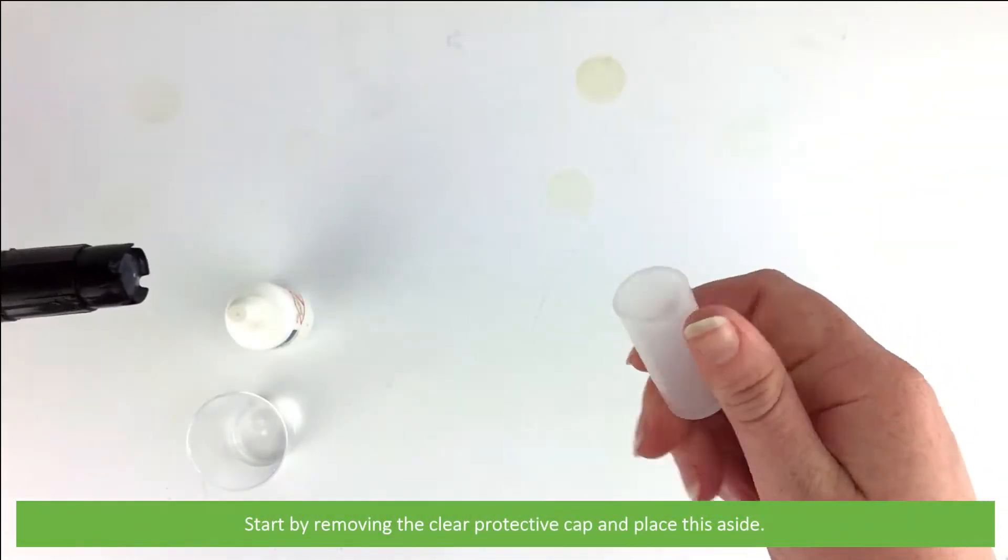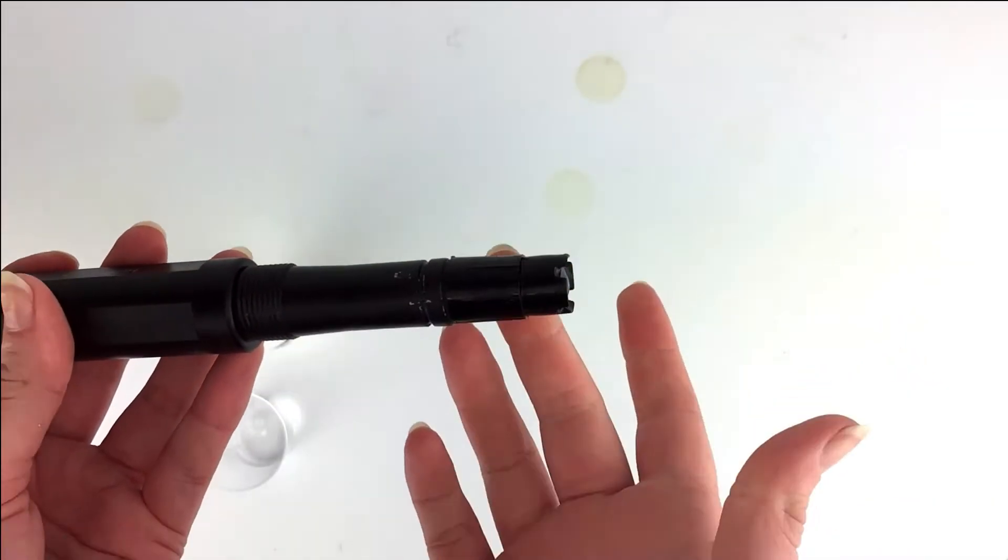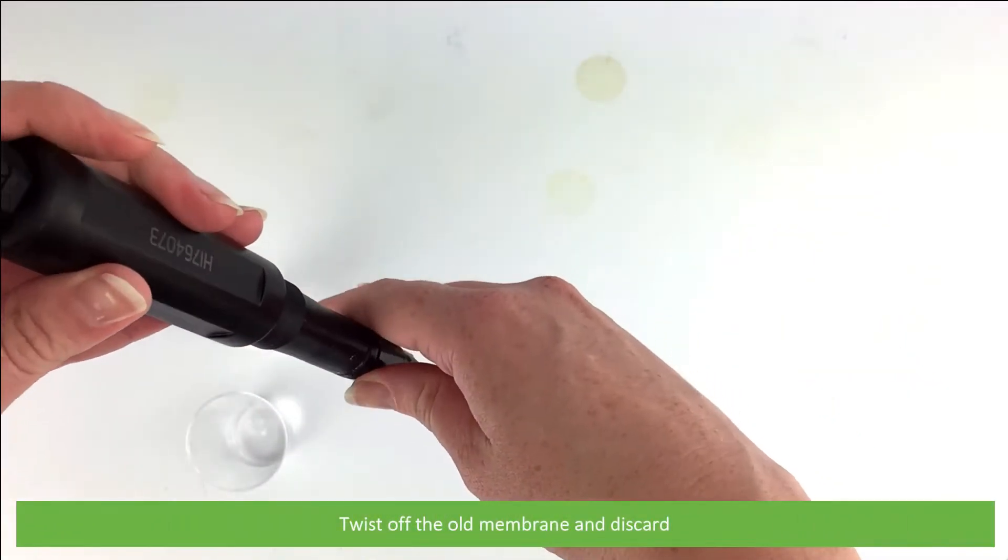Start by removing the clear protective cap and place this aside. Twist off the old membrane and discard.